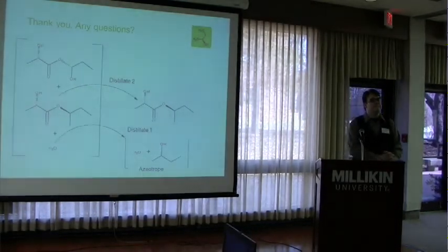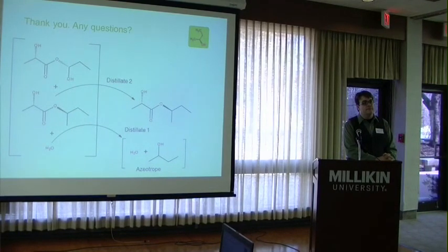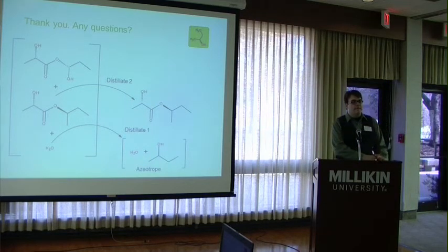Yeah. You said you were able to compare to the absolute value found in literature for the compounds that you're trying to determine the purity of. For all of these different branching ones that you're looking at, is there literature that's already shown what their specific rotation is?